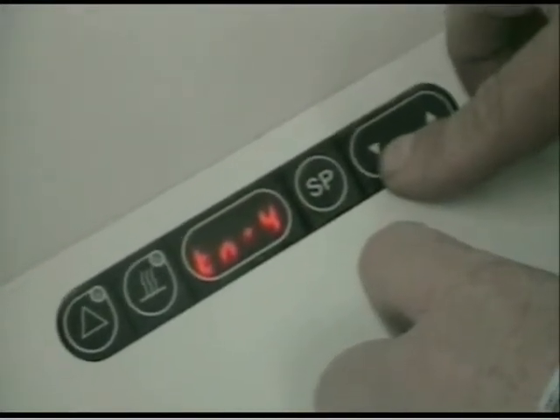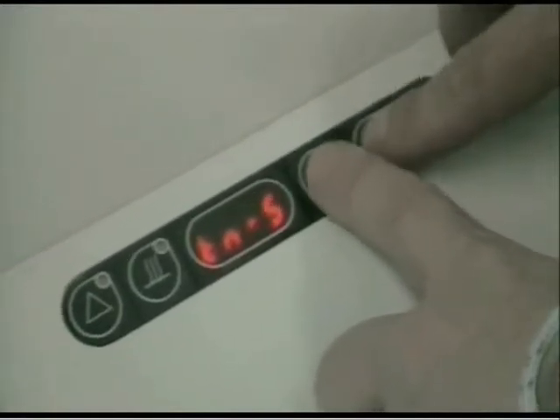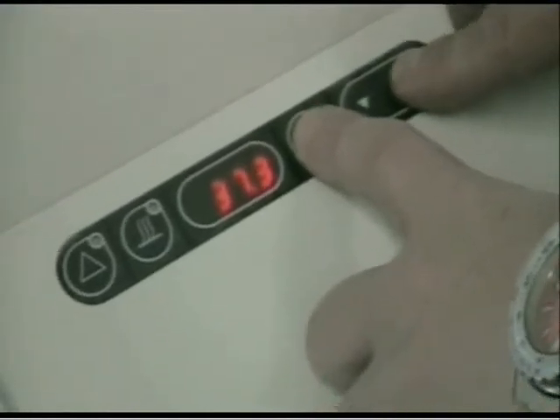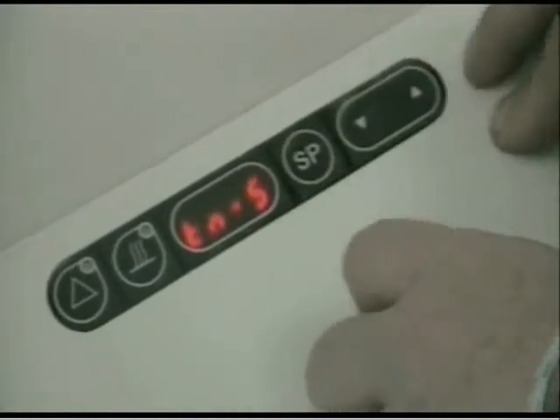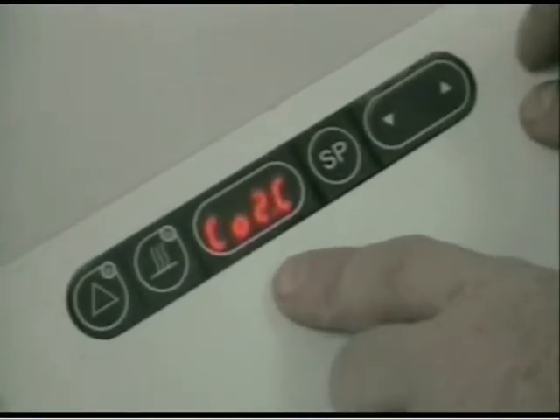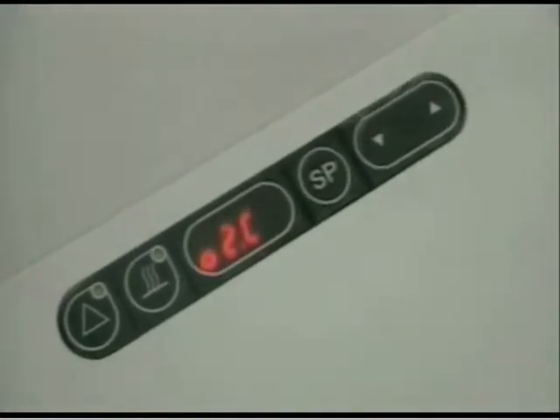And then tune 5 is 37.42, so that will be 37.4. Now we have finished adjusting the tune values. We exit the menu to let the values store, and we leave the incubator to stabilize again.